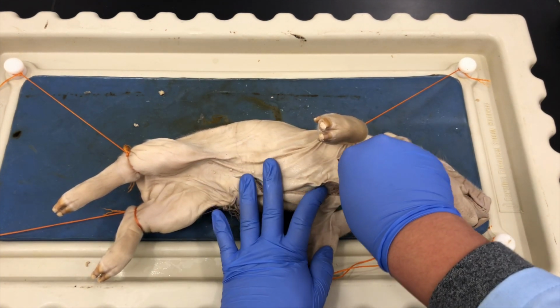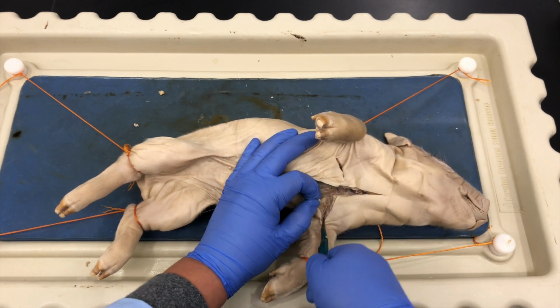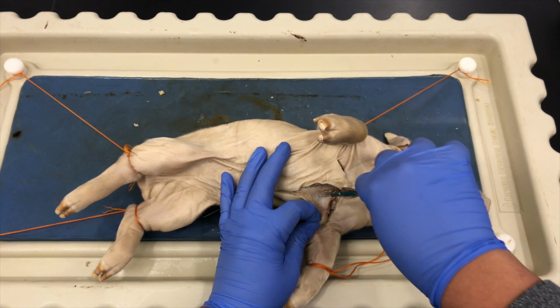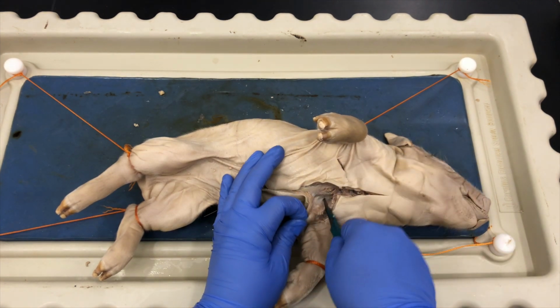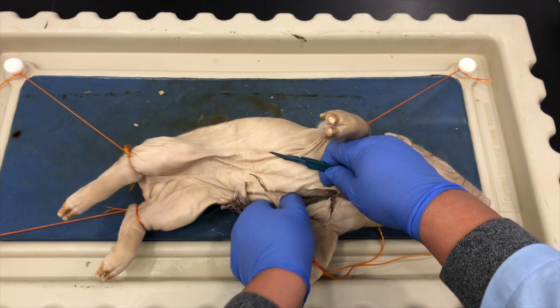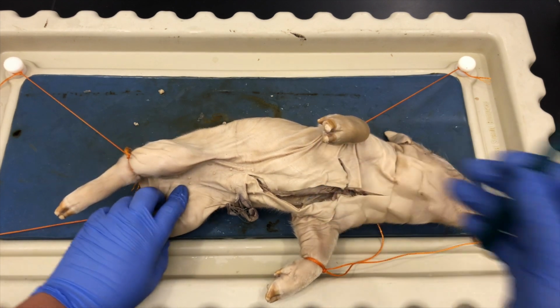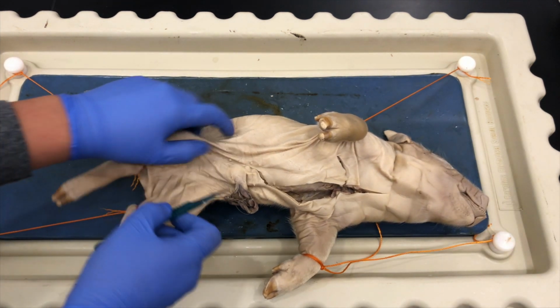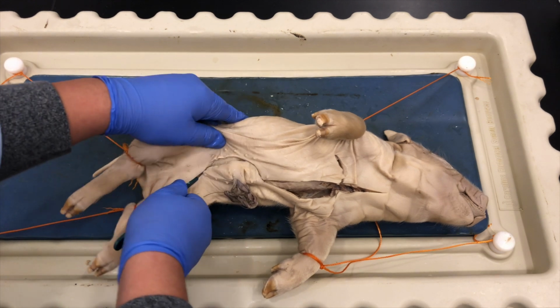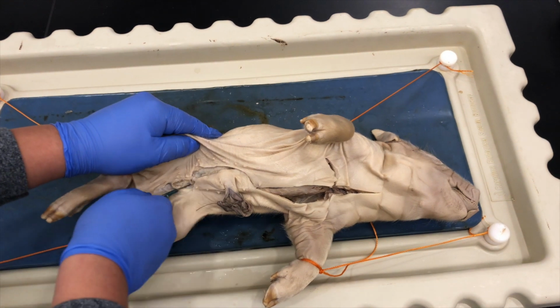And I did the same to the opposite forelimb. At this point, there was some very soft tissue that I could just slightly tear with my hands. The next incision was continuing around the umbilical cord and down towards the anus.